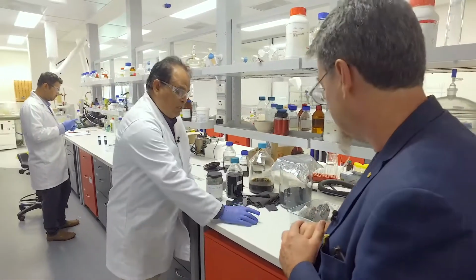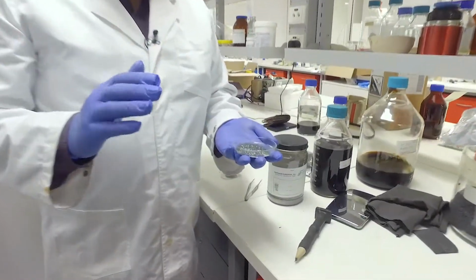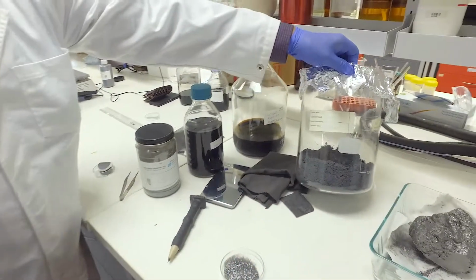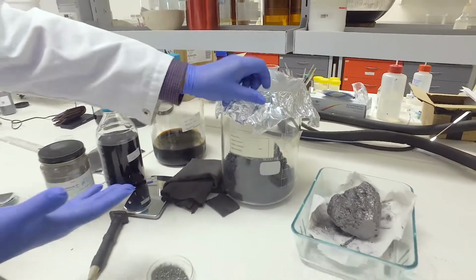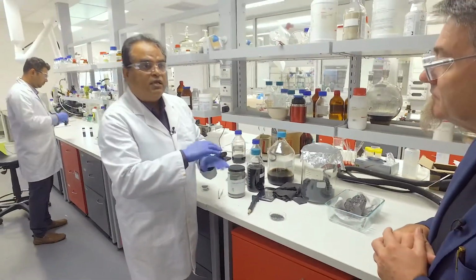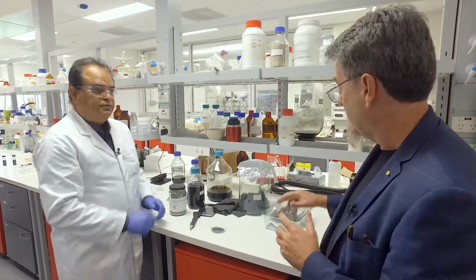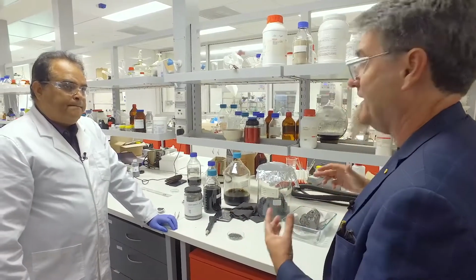The volume expansion here, this is 2 grams of material. The volume expansion is between 700 to 900 times. So this much of material expands to this much of volume. Wow. So this is such a high expansion of this graphite. Once at this stage, now 7 to 9 sheets of graphene are stacked together. The surface area is very high. Now we can very easily chemically oxidize this material. Right, so now we've got this thermally expanded material, and we're going to chemically oxidize it.